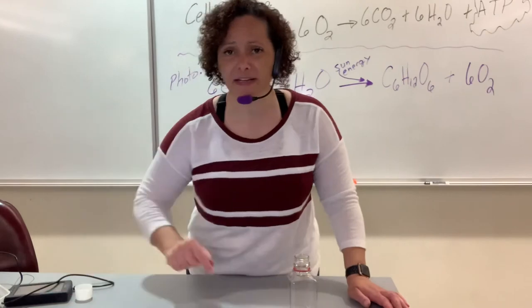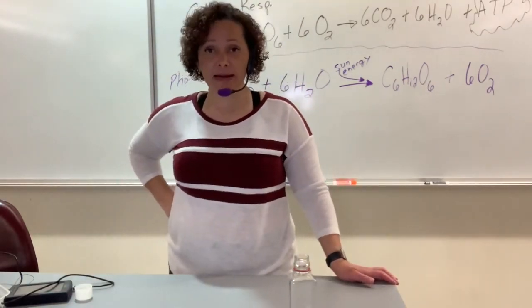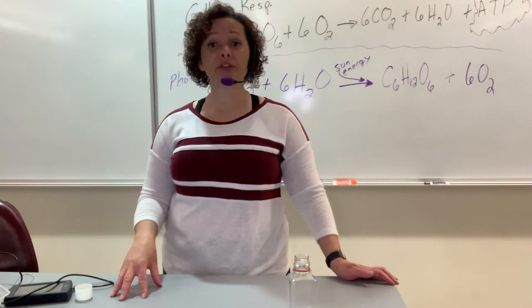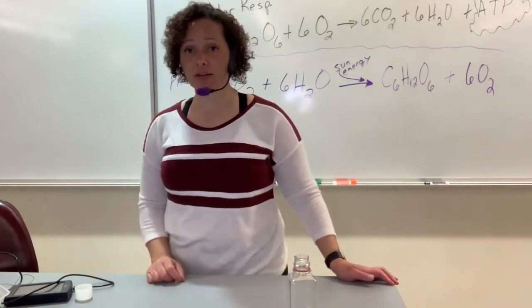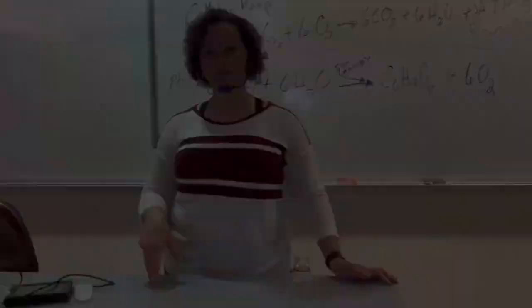I don't care what the order on here says. I say do the dark first, okay? I find what happens when you put certain organisms, certain animals in the light first, they get very stressed, and then they don't respirate when you put them in the dark. You almost think that they died, okay? So I always say put them in the dark first.